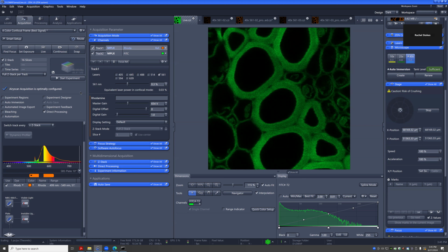So the laser has no warm up? I remember the old systems had a little green button. Usually right at the start, you'll see them warming up a little bit, but it's very short, and they show up as red. While it's red, if you accidentally hit live, it will still scan, but you'll see a little fluctuation. So just wait until the red is gone. But again, that doesn't take very long. There's no standby mode or anything? No.